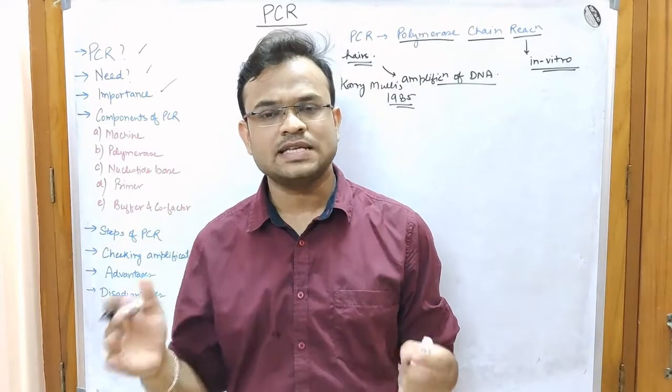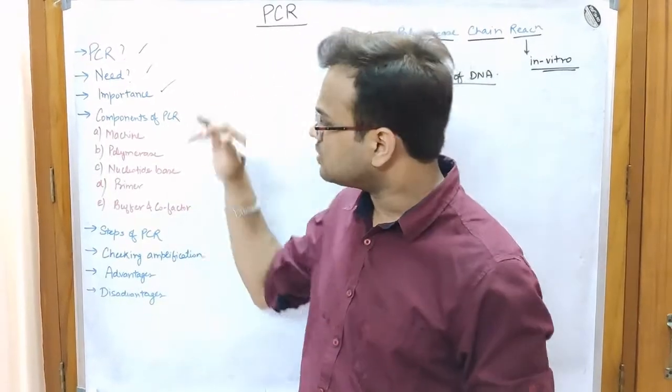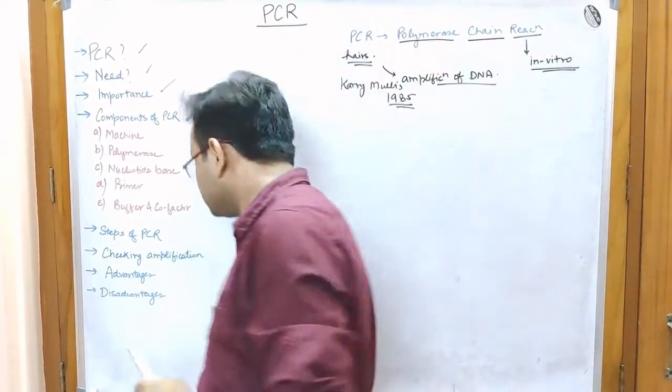This was a basic introduction about what is polymerase chain reaction. Now let us go into the details. Coming to components of PCR. What are the components of PCR?